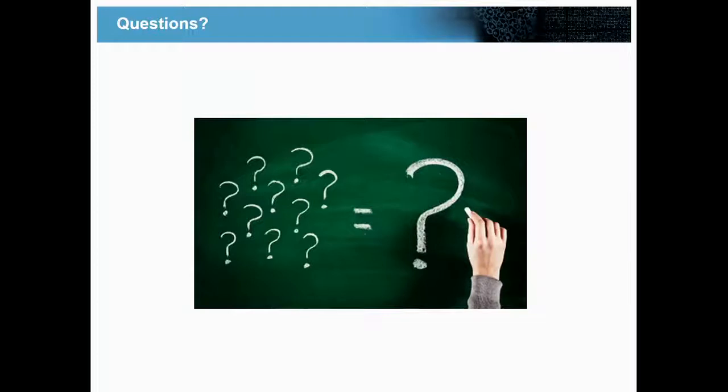She made lists of these and checked whether they work for this purpose, and they basically work most of the time. She has a paper in MCP about this from 1 or 2 years ago. She calls it CiRT. I forget what the C stands for. Conserved. Okay, conserved iRT. That's good.